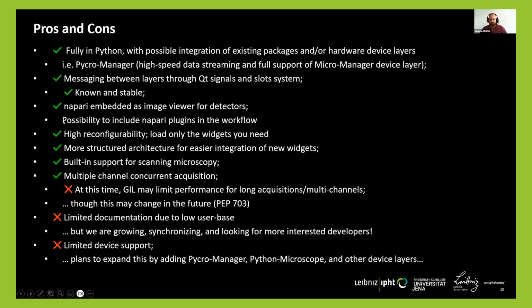And there's also the possibility to include existing plugins in the workflow and make them communicate with ImSwitch itself. Like I mentioned, higher configurability, and you only load the widgets that you need for the specific setup. It has a more structured architecture and it's easier to integrate new widgets, especially in the case of reviewing the work that has been done by other people and trying to inherit from that.